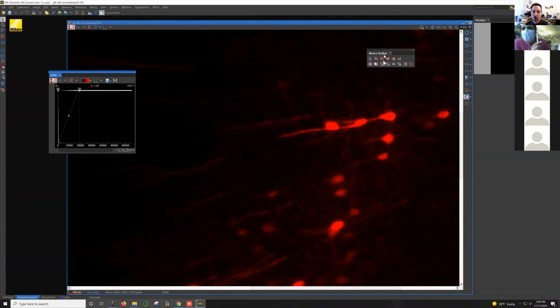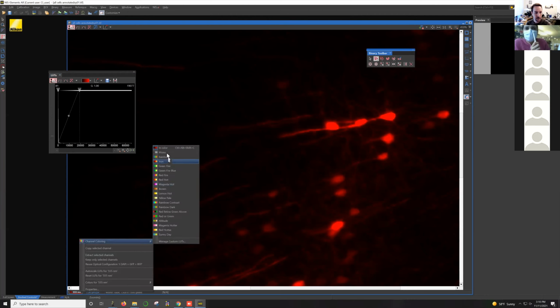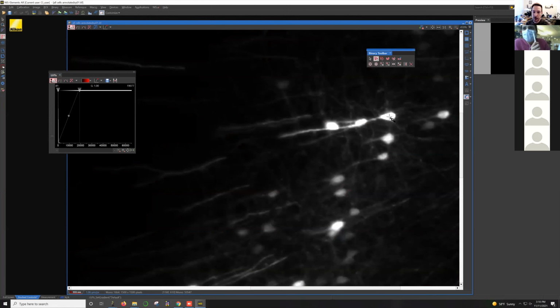So, if you've got this open, then this tool here, it's like an auto select tool. You can just very quickly use this to, and I'll make this grayscale so you can see. Just left clicking, it'll quickly try and figure out how to connect all these things together. This is like a lower threshold. I'm just using the mouse wheel to scroll back.